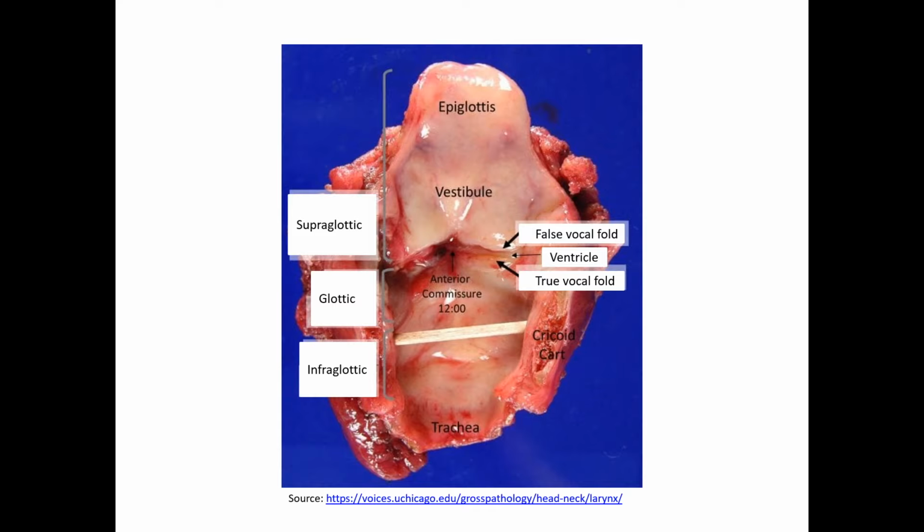If they're diving, I need to see how deep they're diving into the surrounding soft tissue, into the adjacent structures. Yeah, that's probably the most critical section that I see. Okay. So if we only had one block printed, for instance, that's the one that we would go for.